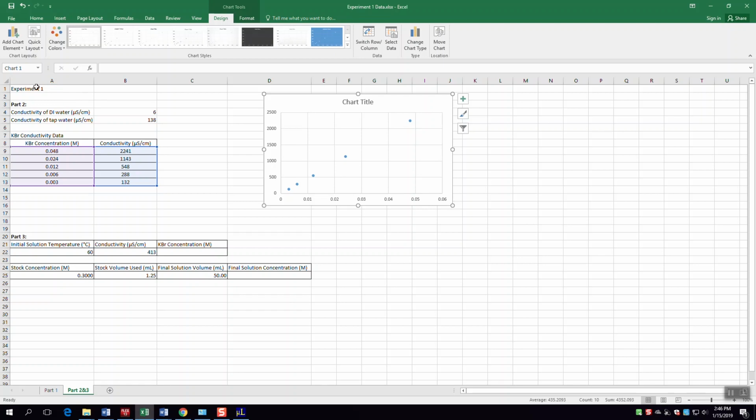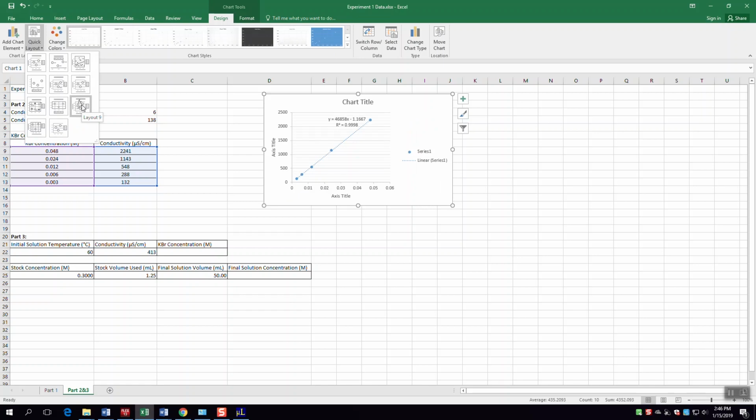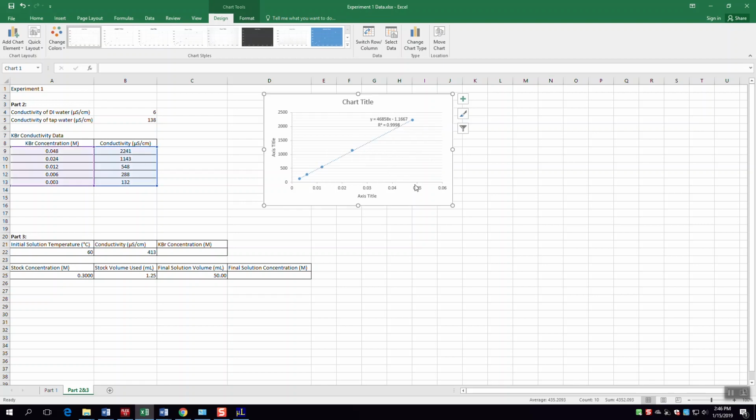Then I'm going to go ahead and get rid of this little bit over here, and doing that automatically adds our line of best fit, as well as displaying the equation of that line and the R squared for that line. If it wasn't there automatically, we'd have to right-click on our data points and choose Add Trendline. Luckily, it's already here. So, next we need to add a title and labels to our axes. In this case, we are measuring conductivity versus concentration. Then we need to label our two axes as conductivity, along with units, which I'm going to go ahead and copy from over here.